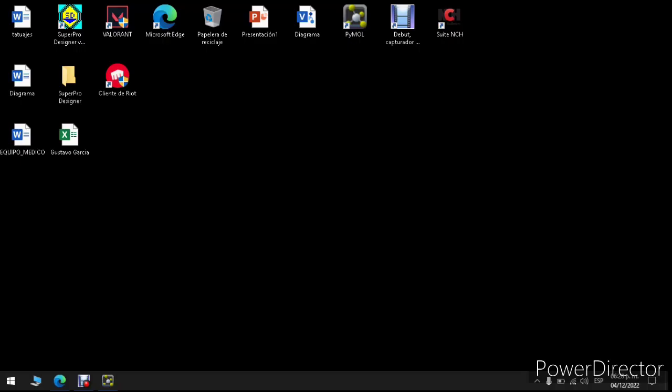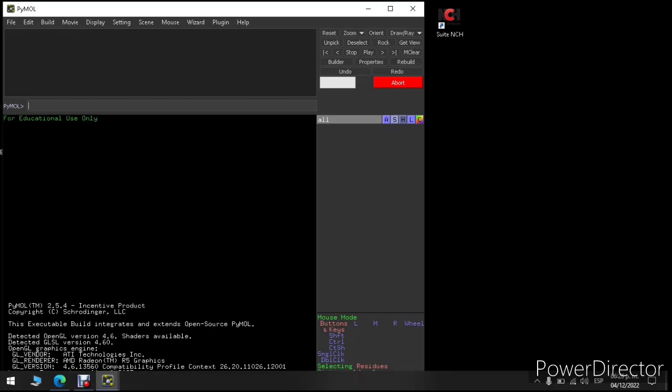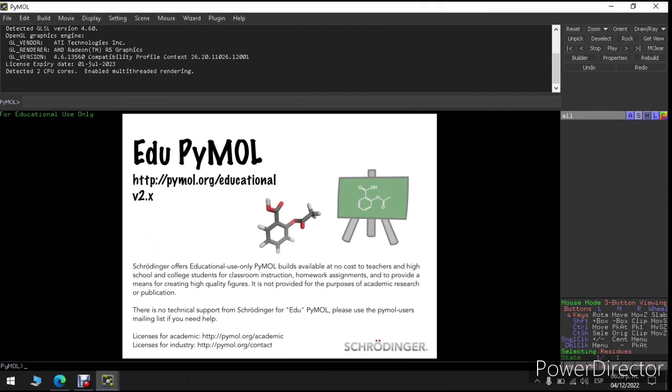Good afternoon, teacher. In today's video, we're going to talk about a software to visualize proteins in 3 dimensions. This software is called PyMol. It's for education studies in molecular biology. And in today's video, we're going to talk about how to use it, ways to install, and other curiosities about this software. I hope you enjoy it.